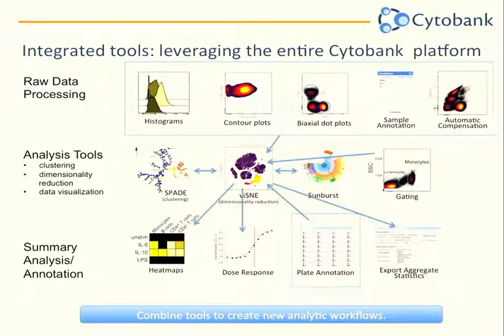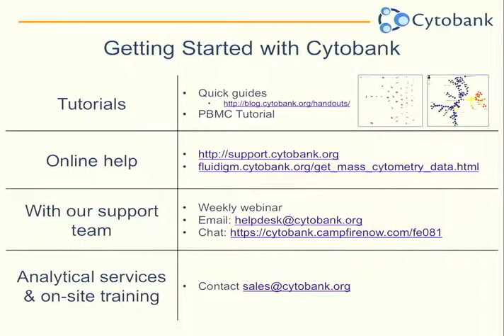For those of you interested in getting started with Cytobank, there's our tutorials. So we have our YouTube channel. If you just Google Cytobank YouTube, you'll see a number of videos showing how to get started with Cytobank. We also have our quick guides on our blog, which links to not only data sets that are available on Cytobank, but step-by-step, like how do I gate in Cytobank? How do I run SPADE? Things like that. We also have tutorials on PBMCs for fluorescence and mass cytometry data.